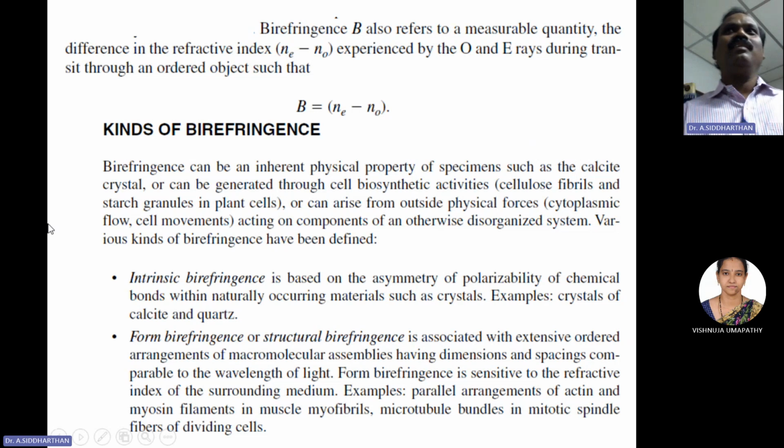Okay. So I can use this microscope to identify the refractive index of a material also. When you use this microscope, if I have a crystal, I can find out the refractive index of the material. For our metallography application, material characterization, we are not into that type of study.